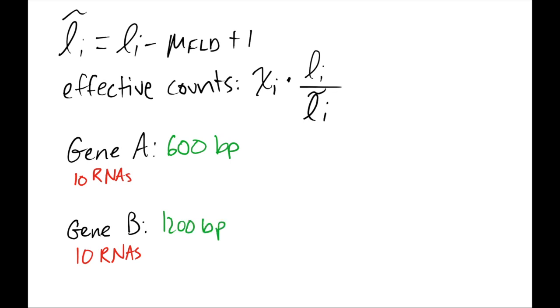We also know that the mean fragment length for this example is 300 base pairs.